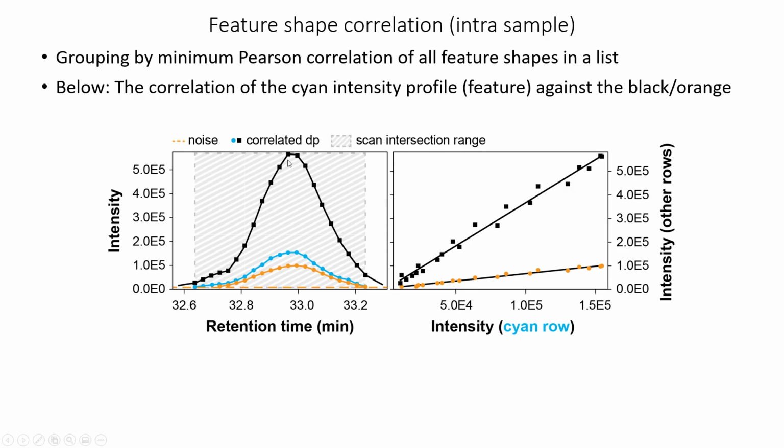And in this feature list, you usually see features that have the same retention time and a very similar shape. And these features are taken from the same sample here. And these features usually correspond to the same molecule. So if we separate molecules and then we ionize in the electrospray interface, for example, we usually create sodiated and protonated ions and in-source fragments and so on, and they have the same retention time and the same shape. And so we group them by Pearson correlation.